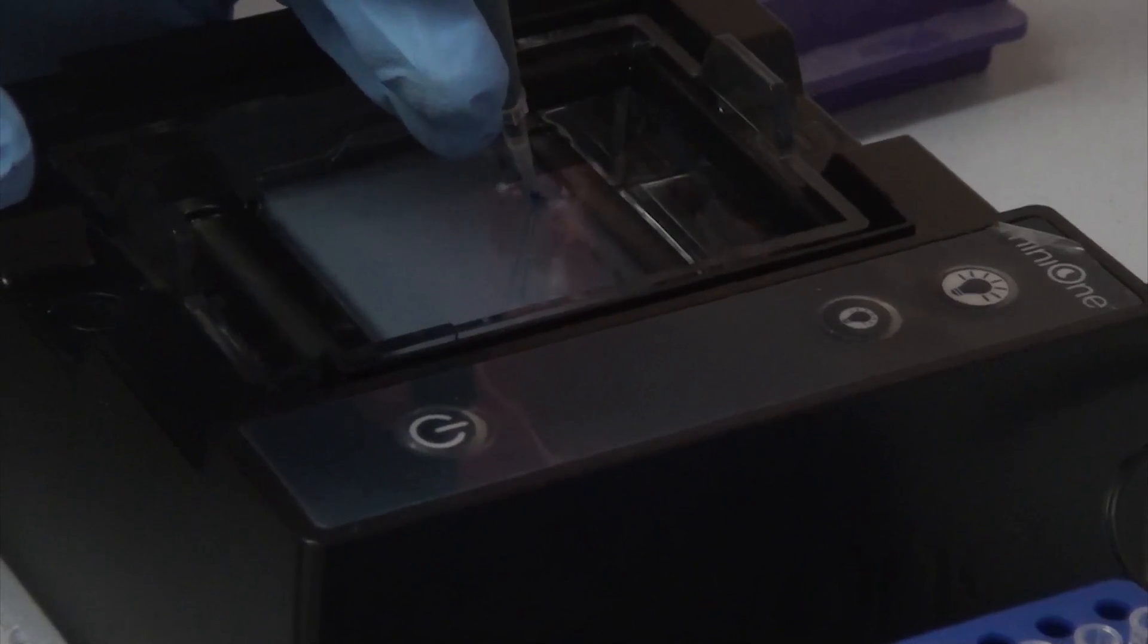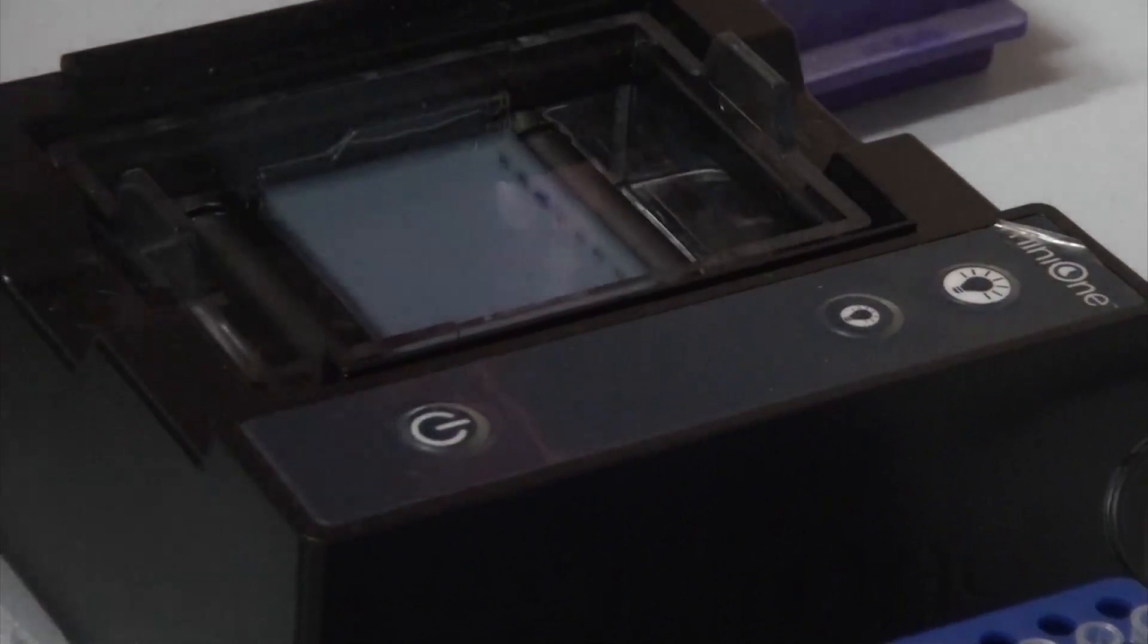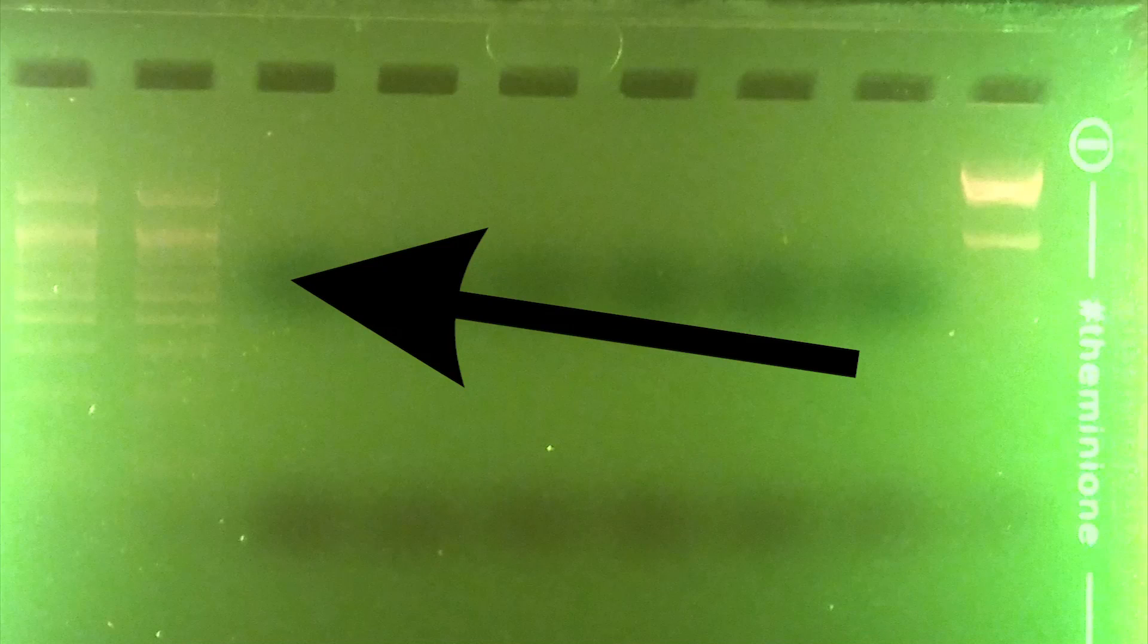We've talked about running a gel in a previous video briefly, and we'll do a more in-depth video about it soon. But the TLDR is that we put a sample of our PCR reaction into a block of gel made of a material called agarose, and then use electricity to pull it through the gel from the top to the bottom. Next to our test we run a control sample called a ladder made of pieces of DNA of known size. The gel's been stained with a dye that binds to DNA, so we can see it when we shine a UV light on it. Smaller pieces of DNA move through the gel faster and end up closer to the bottom by the time we turn off the electricity. We can then compare how far our DNA sample moves through the gel relative to the ladder, and from that we can see the size of any piece of DNA that got amplified. If they're the right size, then our PCR was successful.